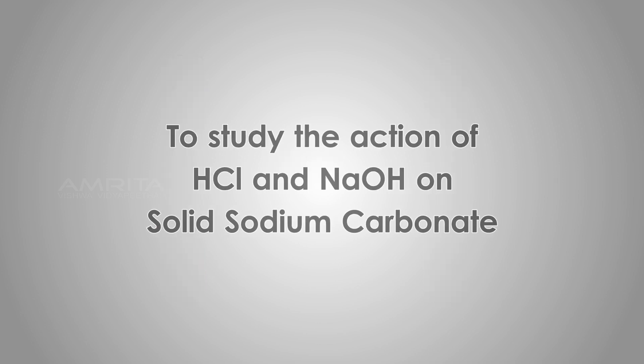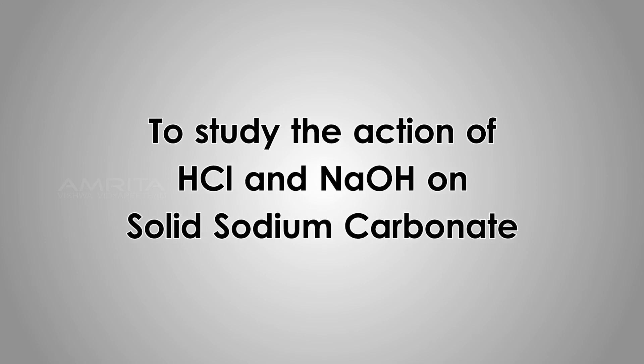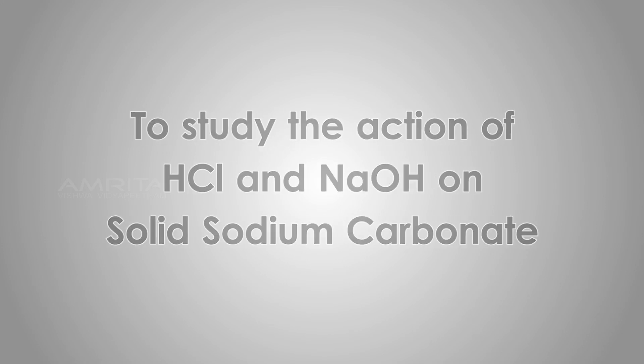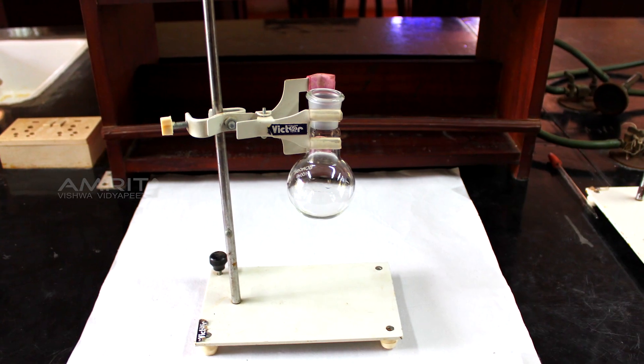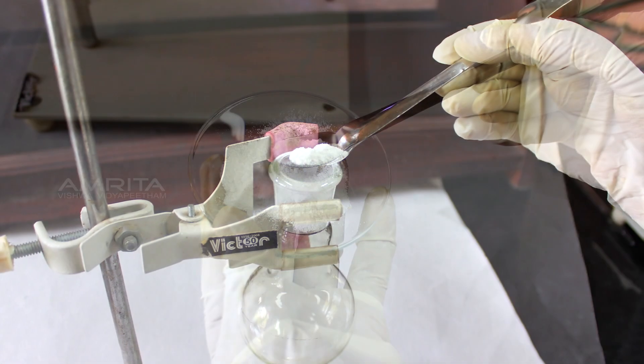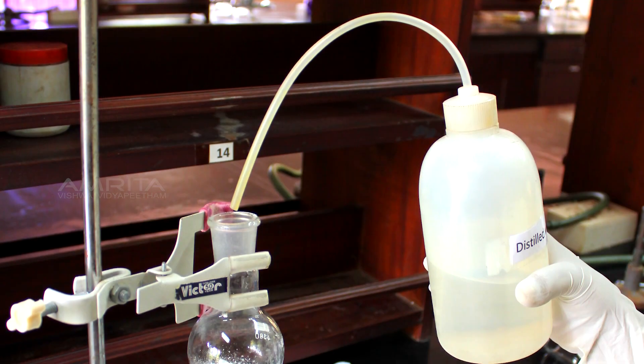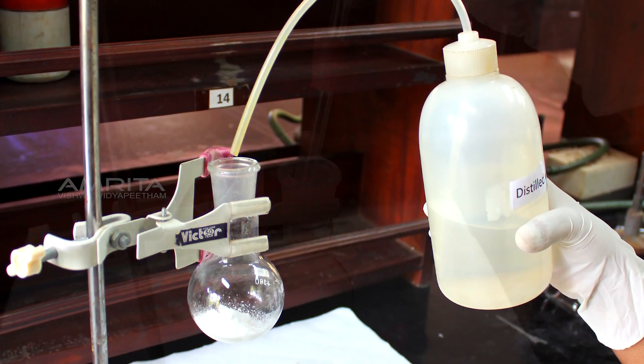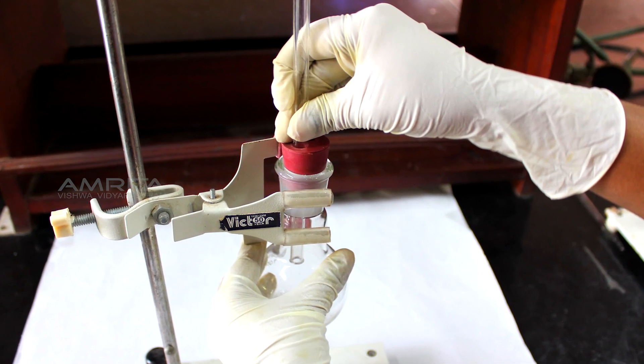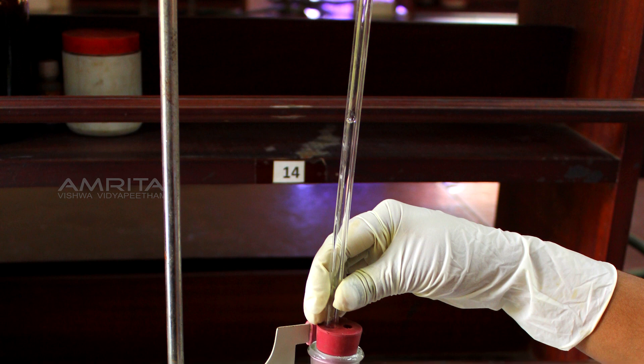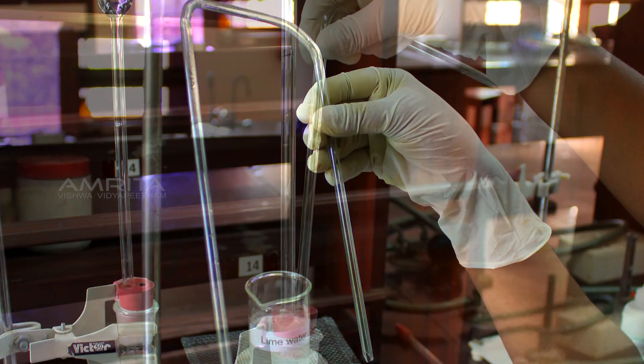To study the action of HCl and NaOH on solid sodium carbonate, first clamp the round bottom flask to the stand and add a small quantity of sodium carbonate and a few drops of distilled water into it. Close the mouth of the flask with a double-bored cork and insert a thistle funnel and a bent tube into the different holes of the rubber cork.